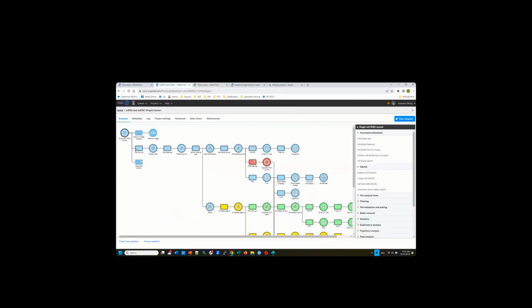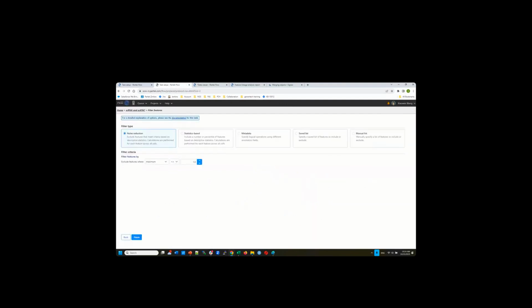All right, so after you filter your data, I did clean up a little bit, and then you're going to perform filter features. Again, we're going to use a very permissive filter. So for every cell, you will see the filter features dialog. In the next week, you're going to see the new release. The dialog kind of changed, but we have more information here. It's the same thing, but changed to different options.